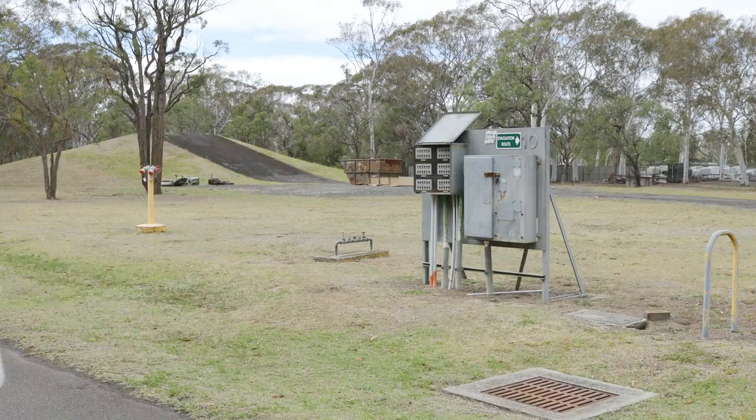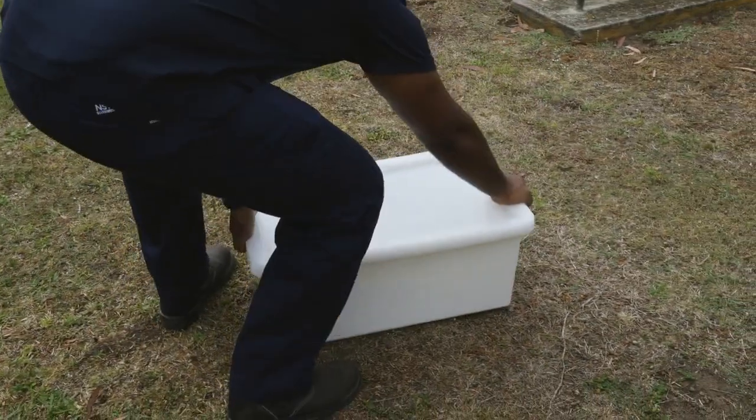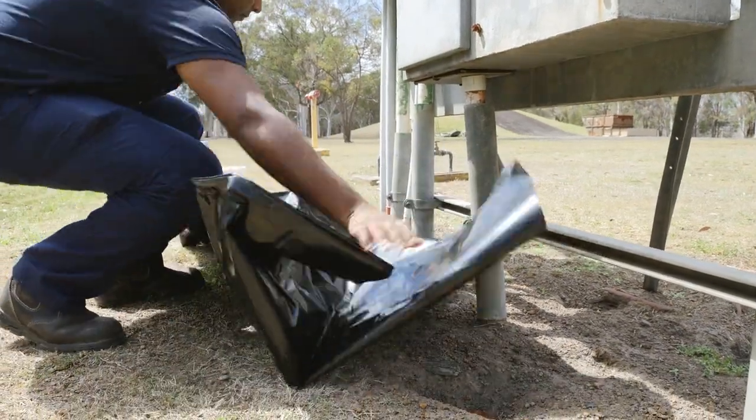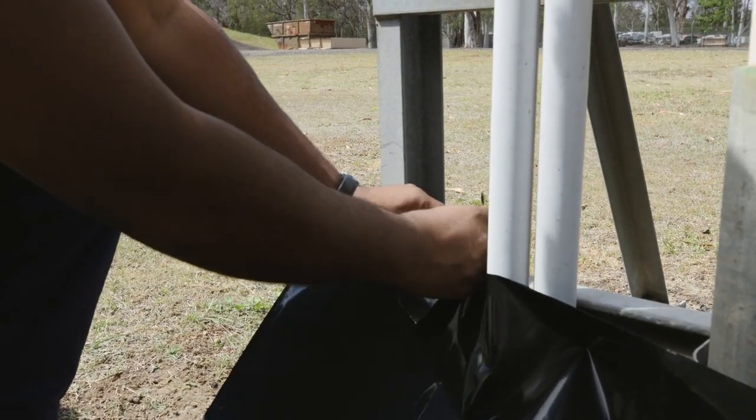Today we're going to demonstrate how to safely take a sample of a material we suspect of containing asbestos. Start by ensuring the area is well ventilated and unoccupied. Lay down disposable plastic sheeting to catch any dust or debris and use tape to secure the plastic.